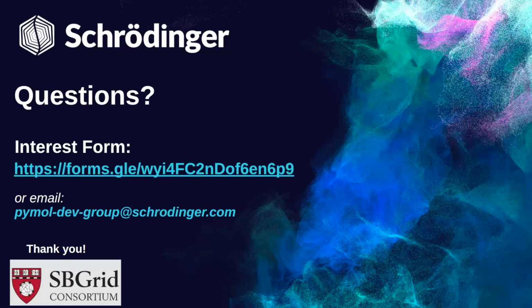But we plan on having the ability for users to input their own rotamer library and use that instead. But for this demo, I just showed our backbone dependent library, the one that ships with PyMOL already.